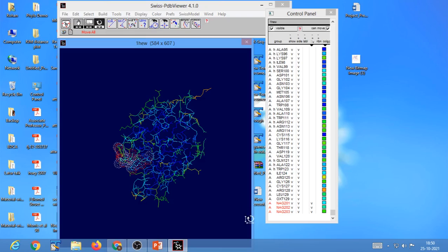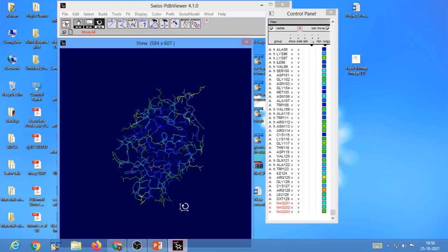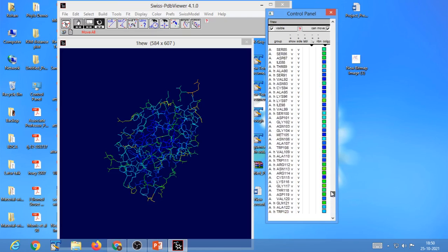So now let us focus on another residue, right? Let me remove the surface of your protein now. Now let us select and center this tryptophan 62. Let me tell you something called option clicking.